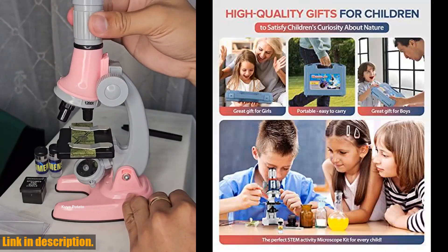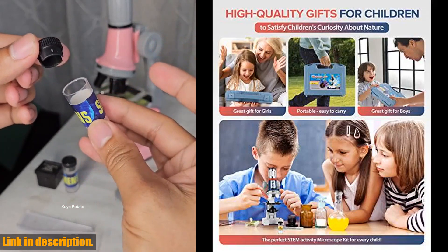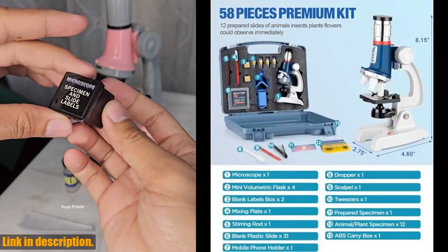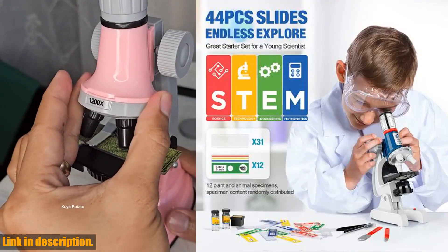Plus, with a 90-day full refund and 12-month warranty, you can trust that you're getting a quality product. This real scientific toy is easy to use and fun to learn with, inspiring a love for science and a thirst for knowledge.